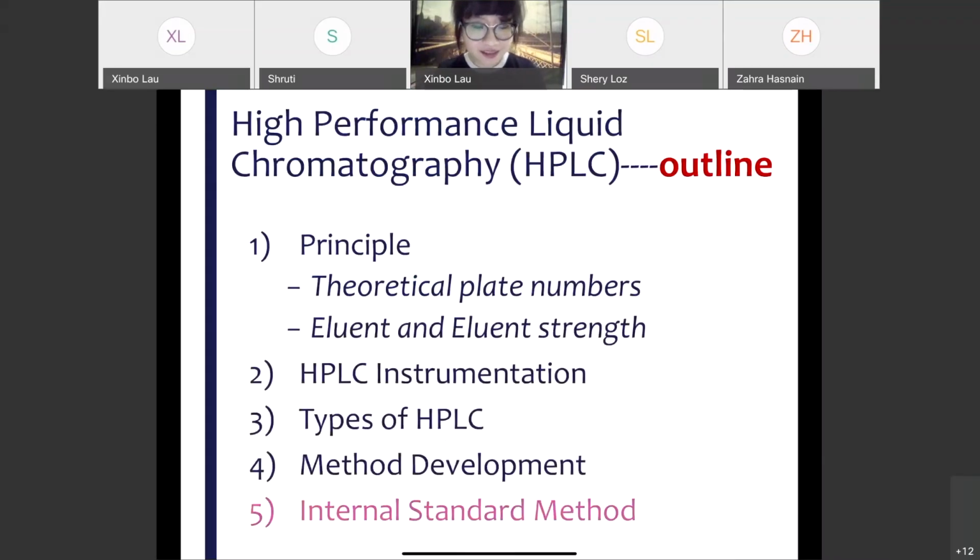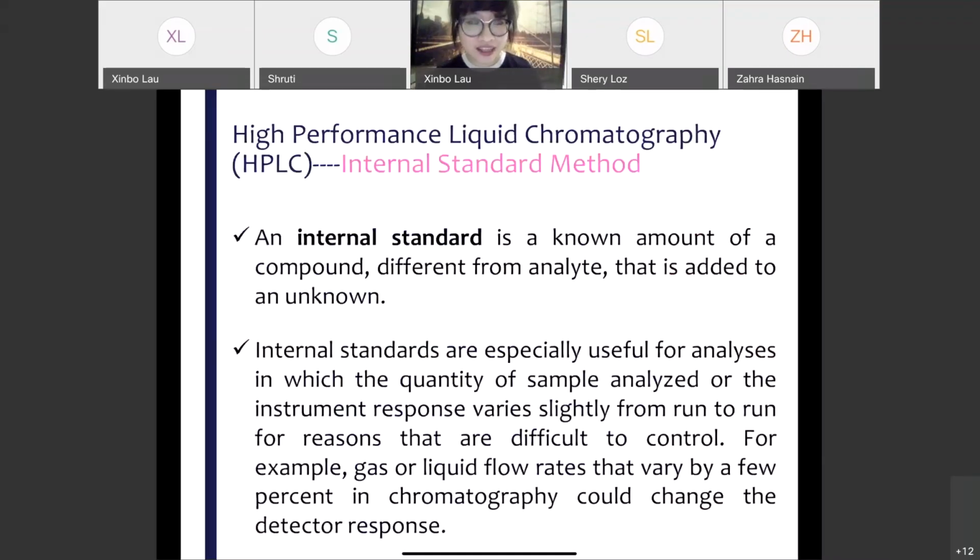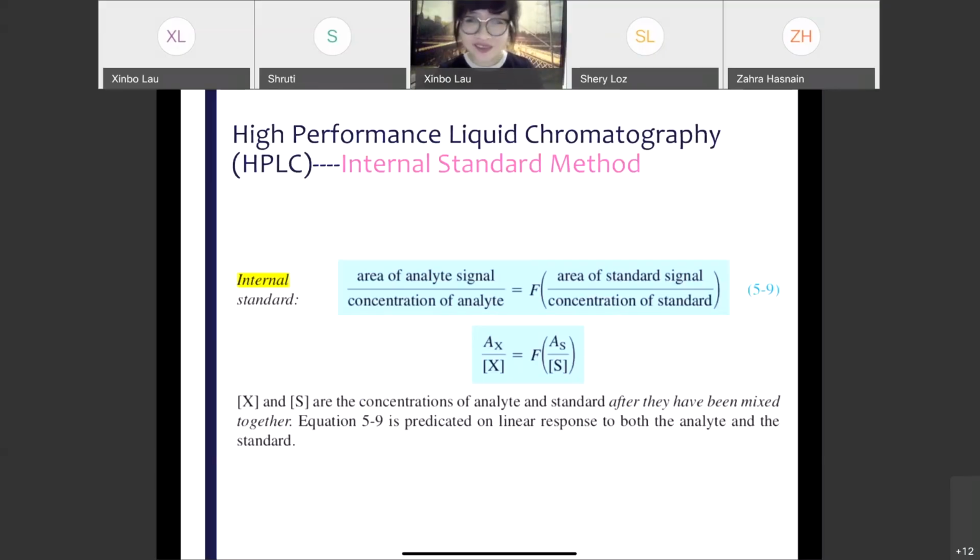And then after you do the separation, you get your data, and we actually use an internal standard. We add an internal standard, and then we're able to study the sample, and again use this to counteract the problem with reproducibility. This is something you're familiar with, right?